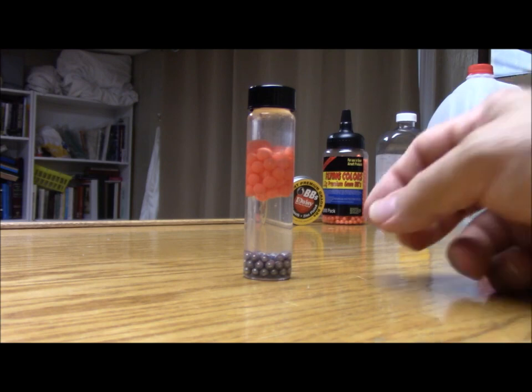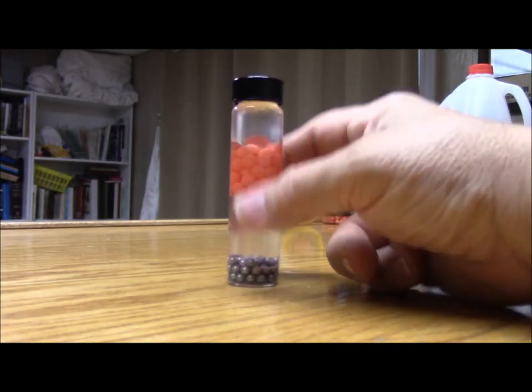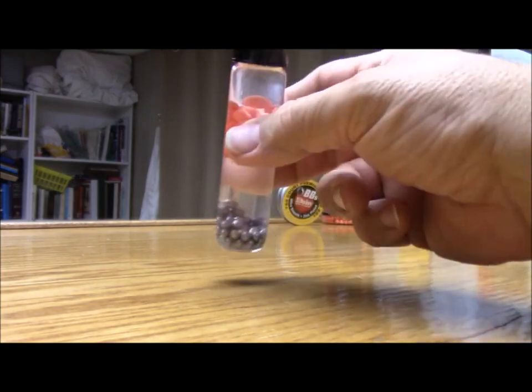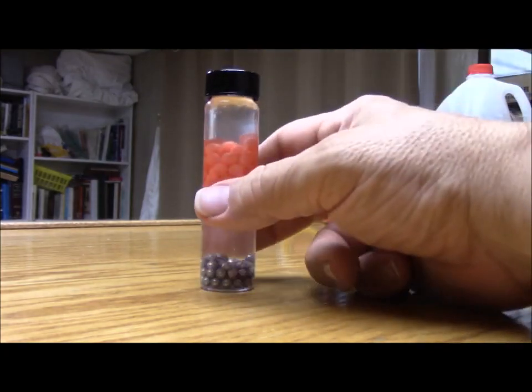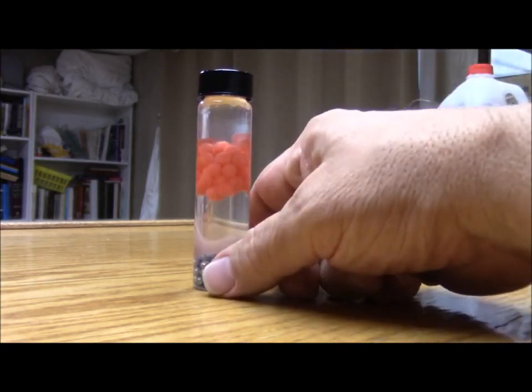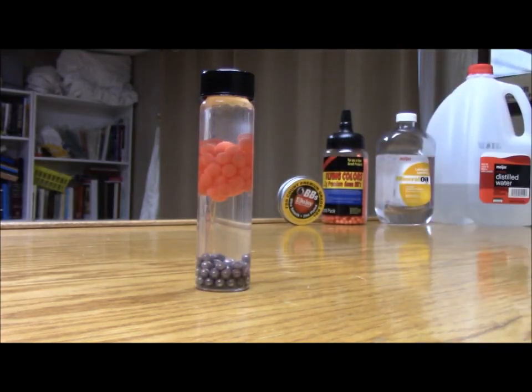So first of all, you see I have a glass vial. This is what the students had in lab today. It's about as big around as a penny maybe, and it's got a black lid screwed onto it, and there are various objects inside. On the table on the front page of the lab handout, it says the following items were available to Mr. VB when he made up these vials. Circle the 4 items you think he actually put into the vials.